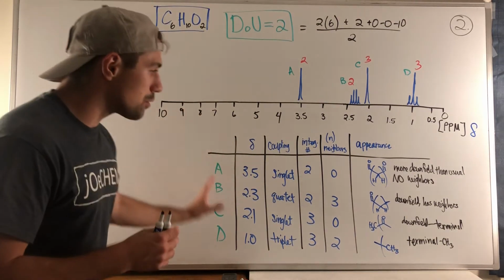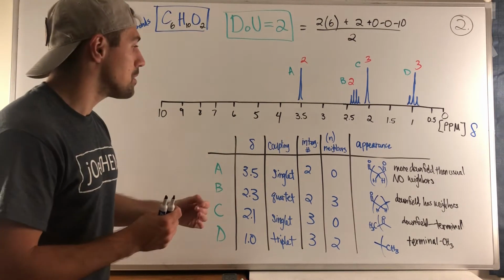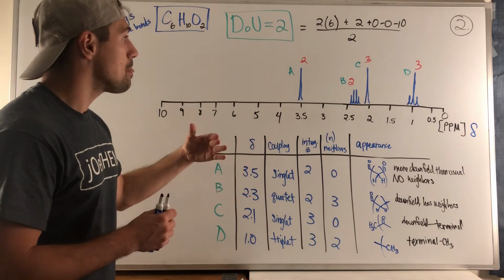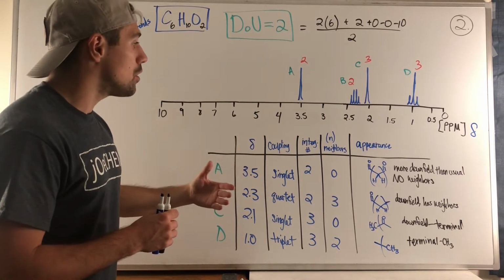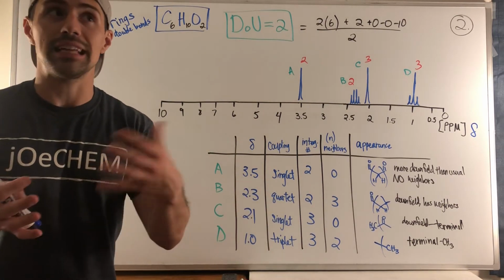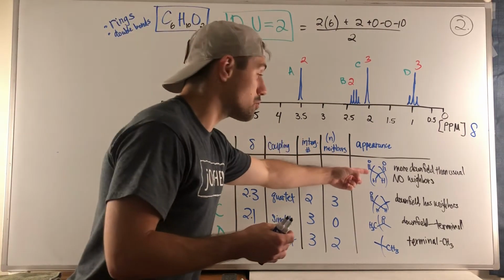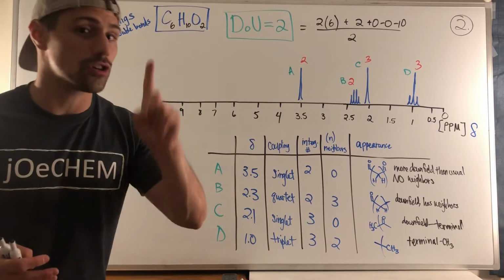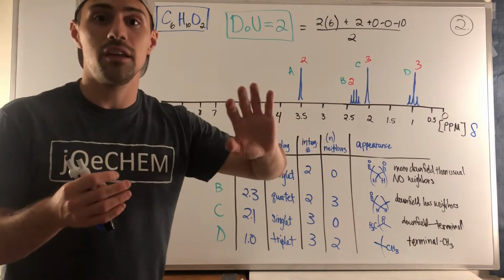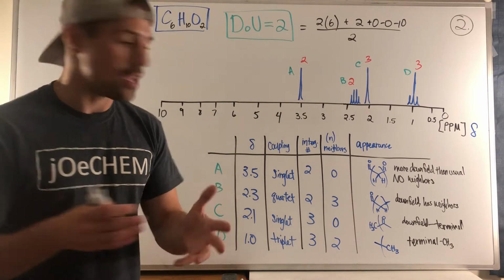And if you went through and made the chart just to pick out some key characteristics, right? We see this singlet here has a shift of 3.5, right? So a chemical shift of 3.5. So no neighbors, and it's more downfield. So more downfield than a typical being alpha to a carbonyl. So maybe it's wedged in between carbonyls, right? That would ensure no neighbors, and that would de-shield it further and put it farther downfield than that typical low 2-ish type chemical shift, okay?